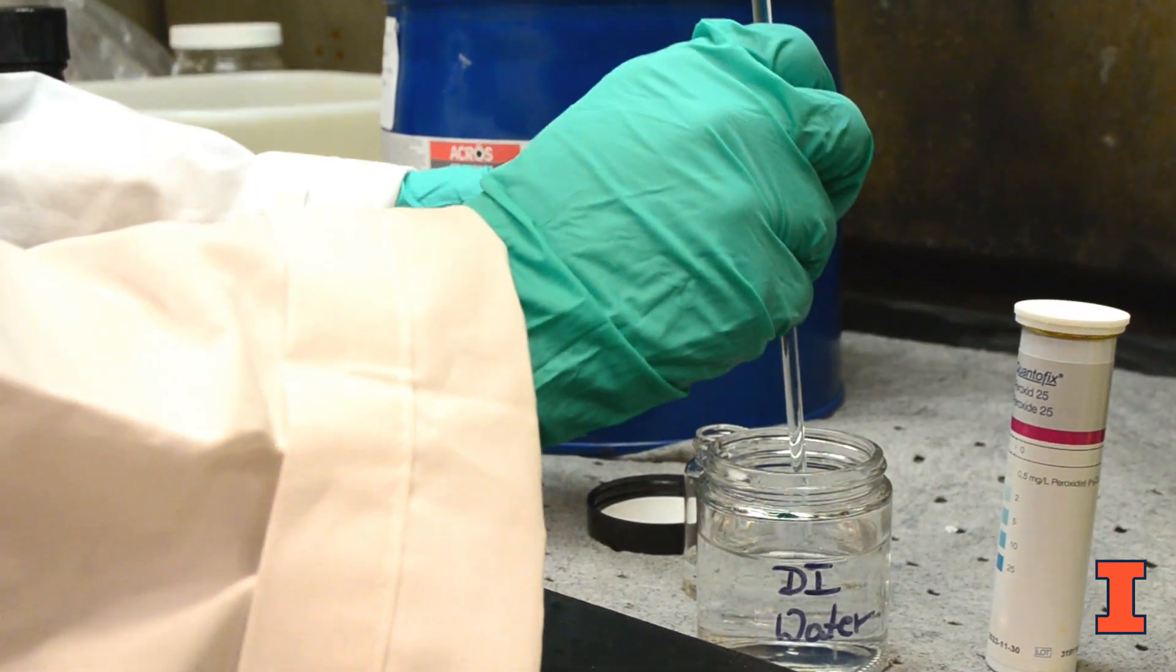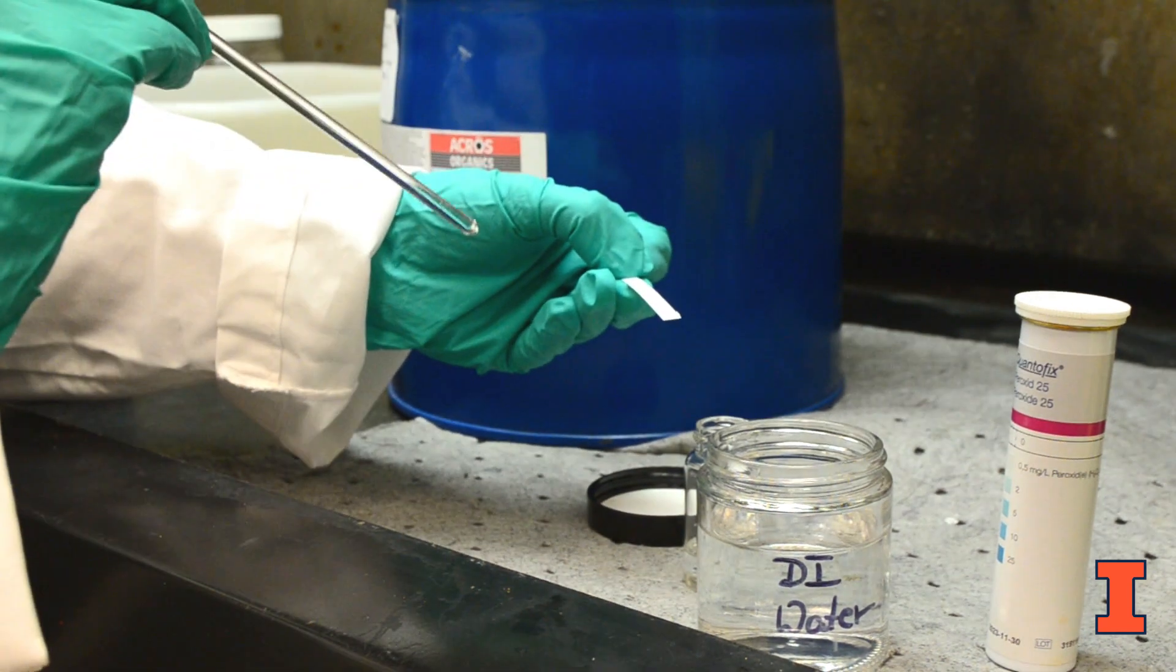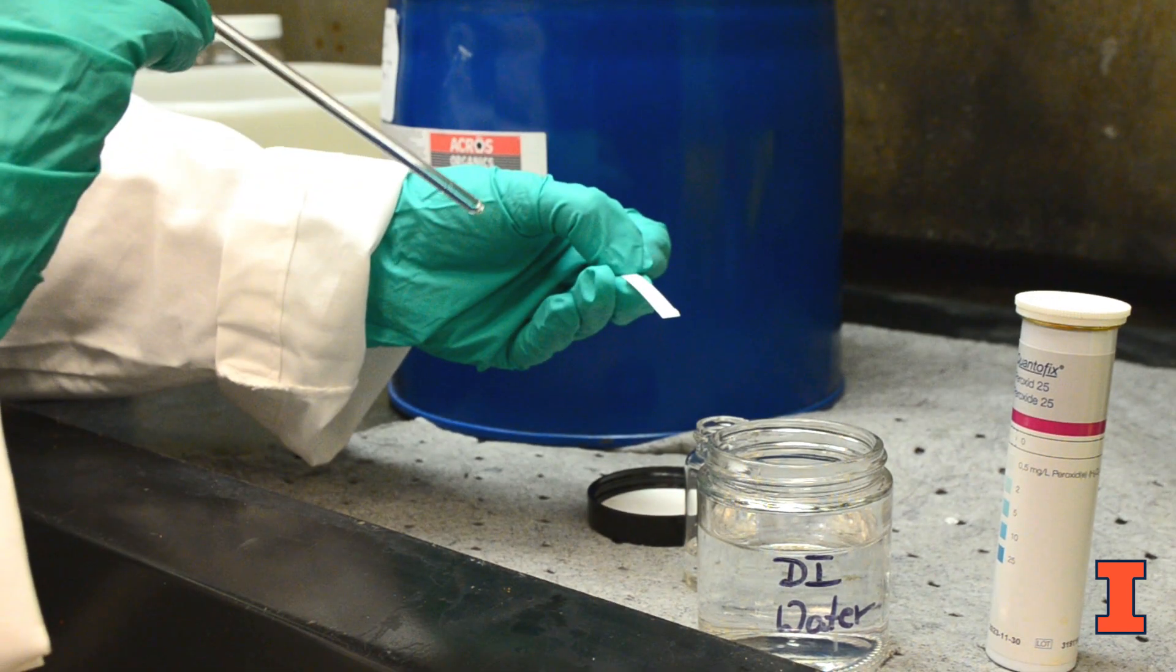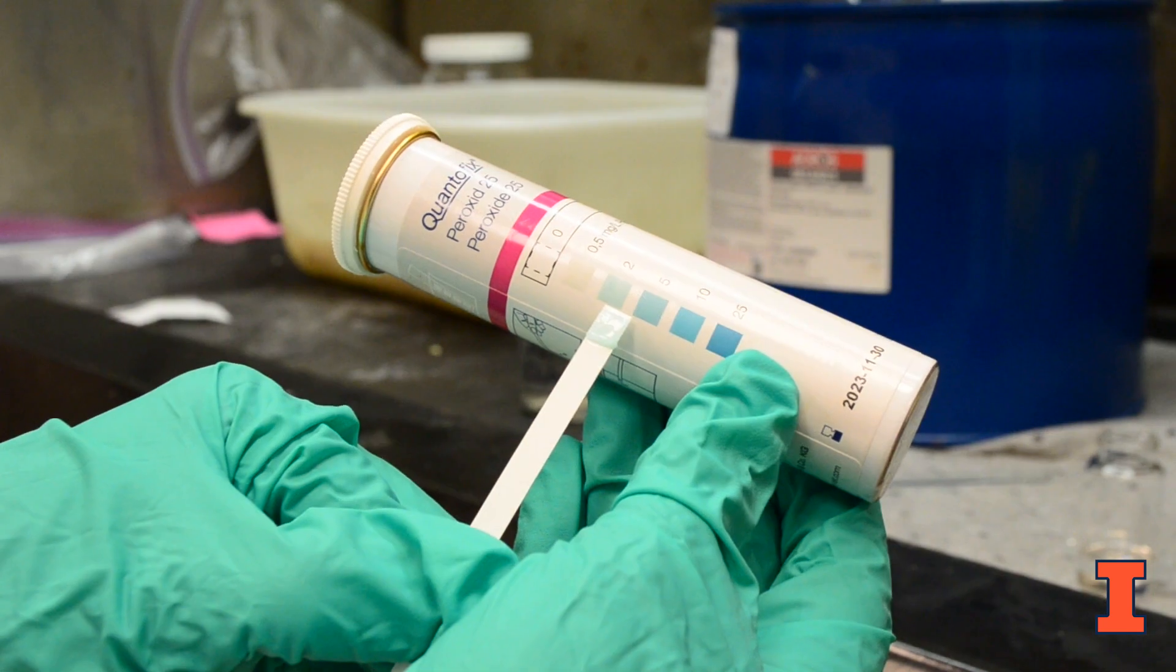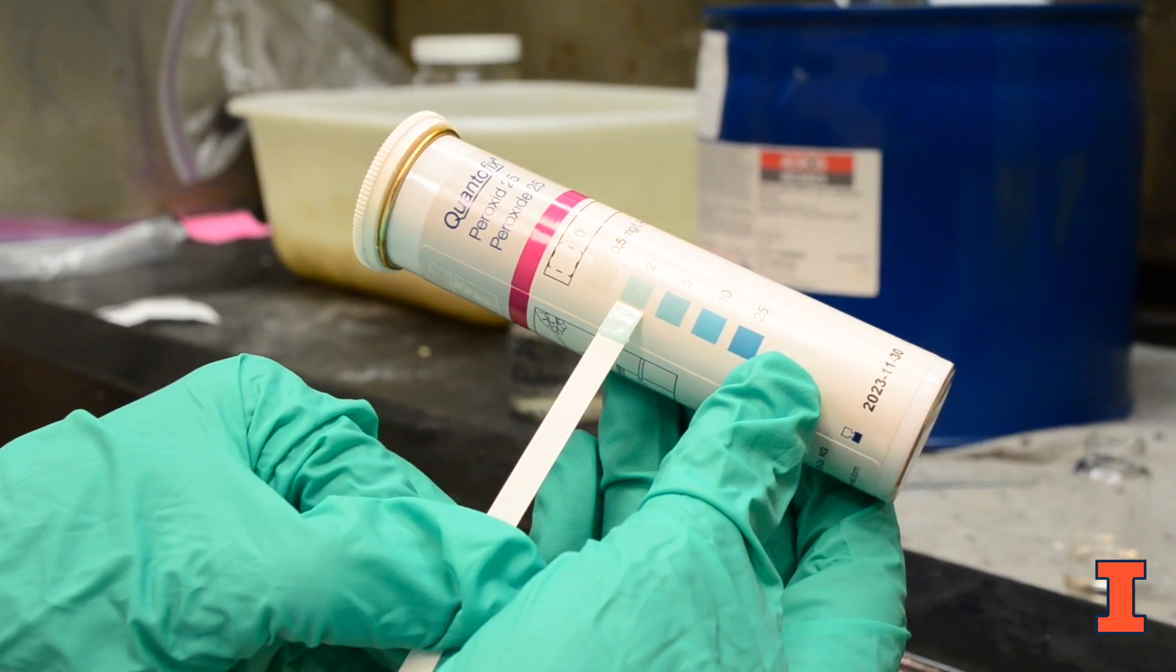If your solvent is organic in nature, remember to moisten the test strip with a drop of distilled water after your solvent dries. Wait for about five seconds and immediately compare the test strip with the provided color scale.